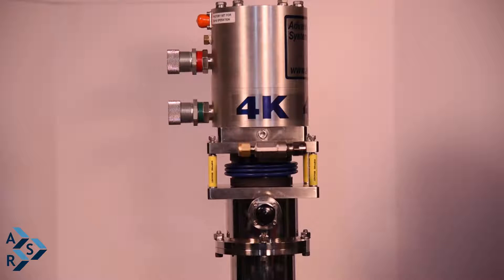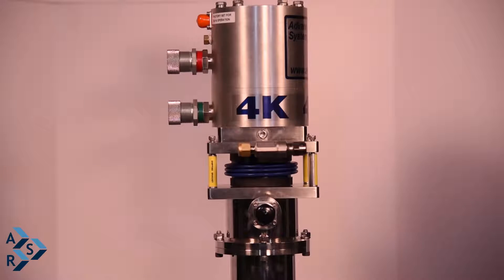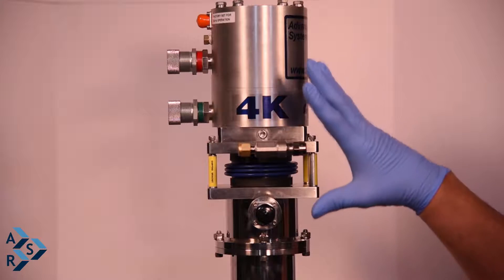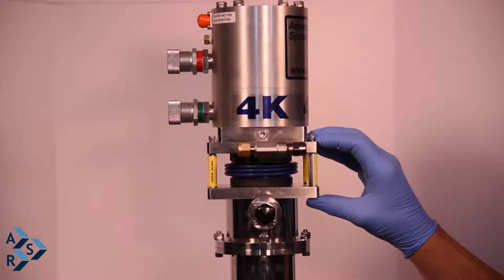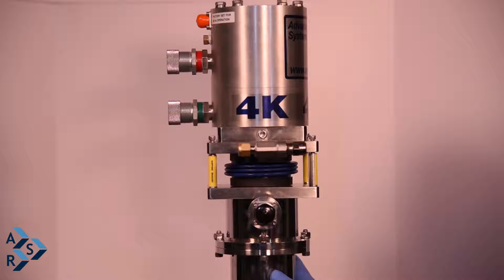What I like to point out on this particular system is the standoffs that actually come with the system. When we ship it to you, it will come complete with the standoffs on here holding your cryostat and your interface together.